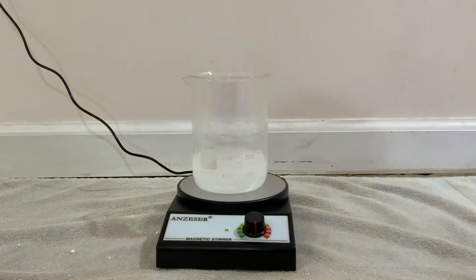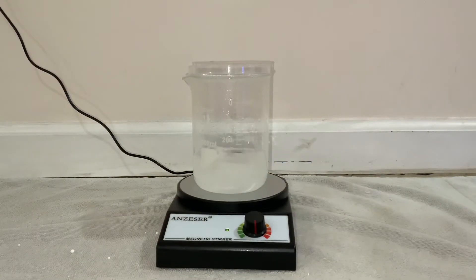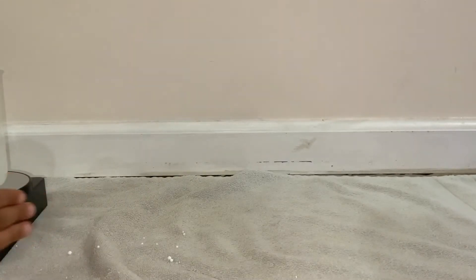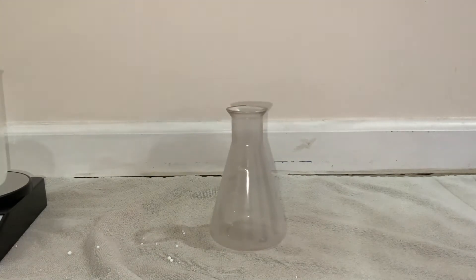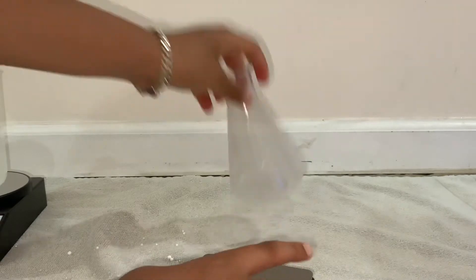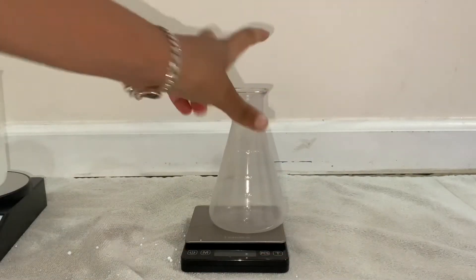While that's dissolving, let's move this to the side. I got a new flask and a scale. Put the flask on the scale.